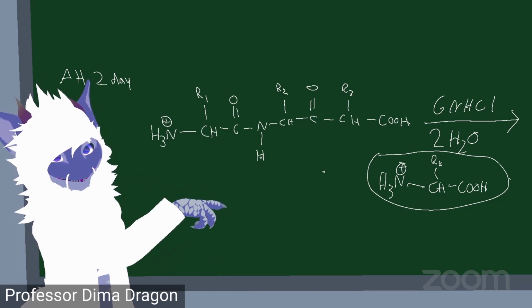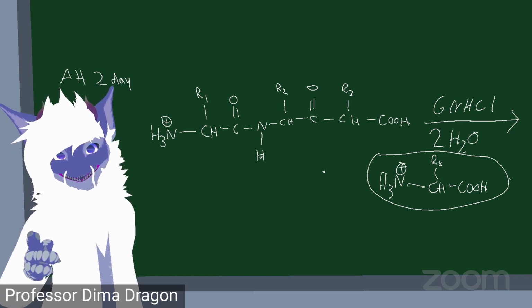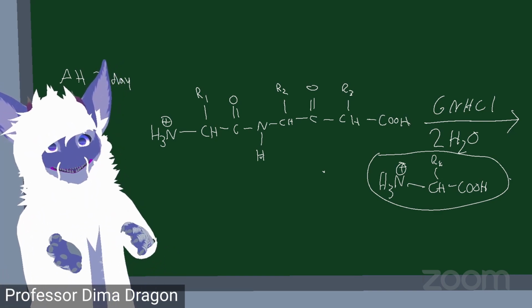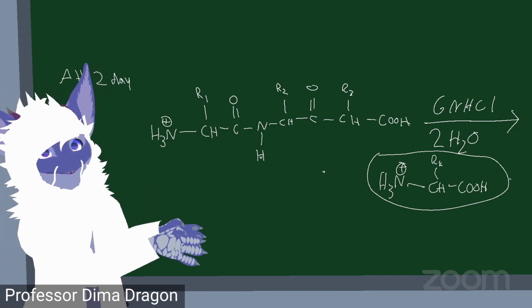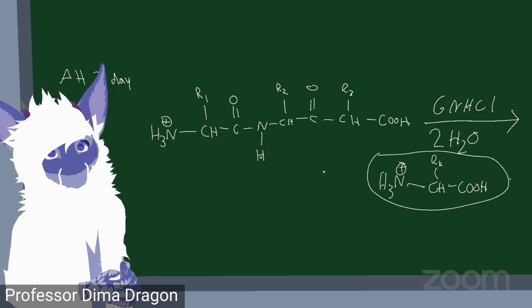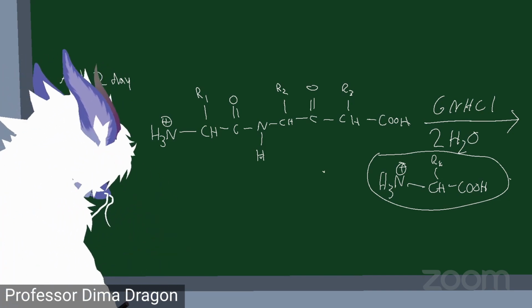Then we can take that and put it on our instrument, and I'll show you guys how to evaluate your chromatogram when I get through the rest of this. So that's the overall for this. I'm going to go over what our lab will look like on day one. This is a 2-day process.